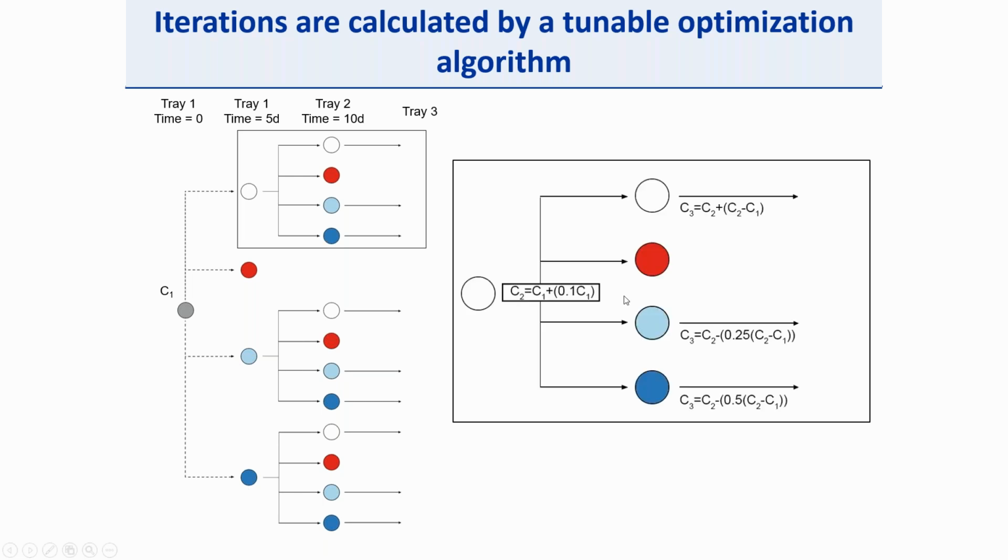And then based upon that score, for example here, let's say our initial score was clear, you can then optimize that specific chemical condition. So if our initial score was clear, our second concentration, C2, will be the original concentration that was in our first drop plus 10%. So really what the algorithm here would say is if the initial drop is a clear solution, then we'll increase the precipitant concentration by 10% and then redo the whole process.